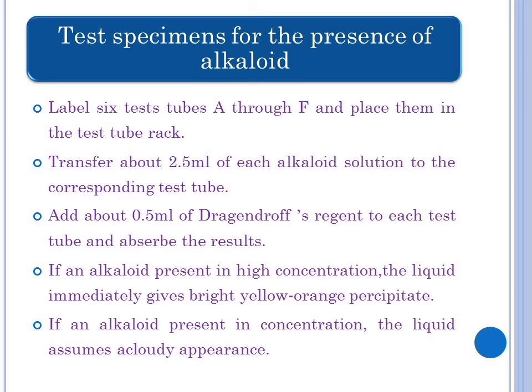Take your developed chromatograms into a closet or other darkened area and view them under your UV light source. If any analyte traces are visible under UV, use the pencil to mark their positions and extent. This shows the striking blue-green fluorescence of the alkaloid quinine, which is present at only 83 parts per million in a bottle of tonic water.